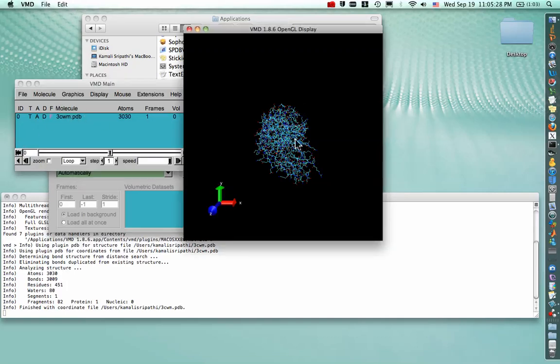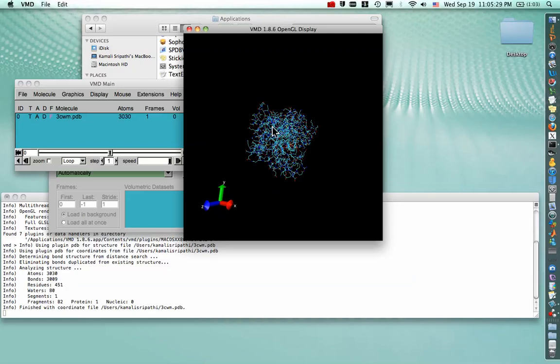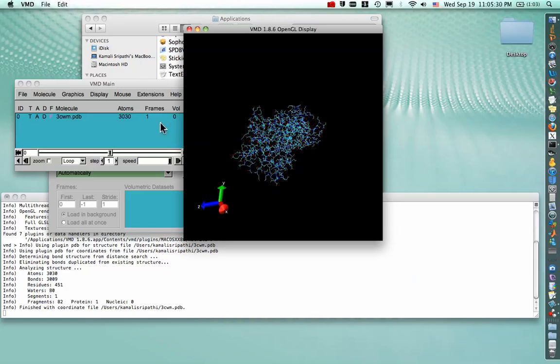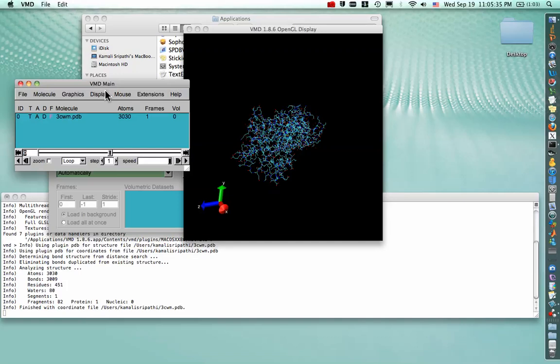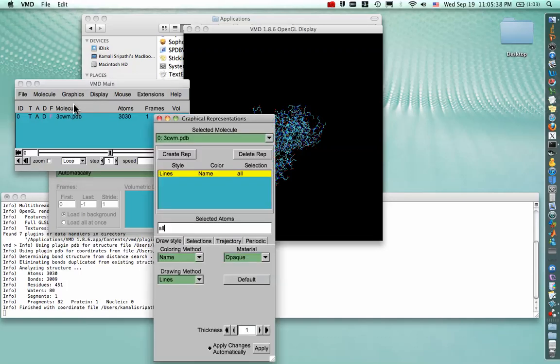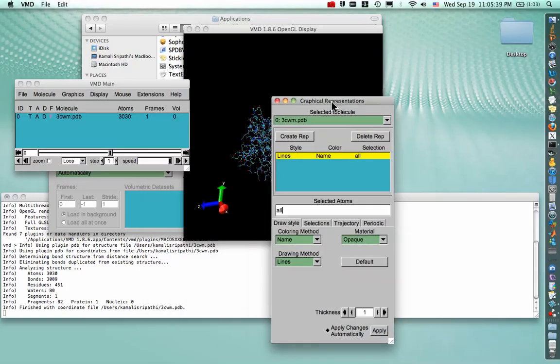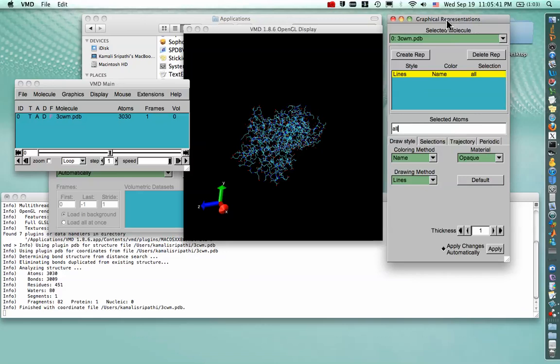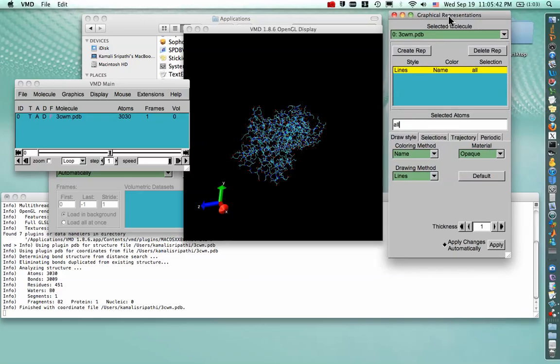And again now, it's in Line Representation. So to change the representation, we go to VMD Main, Graphics, Representations, and that opens the Graphical Representations menu for us.